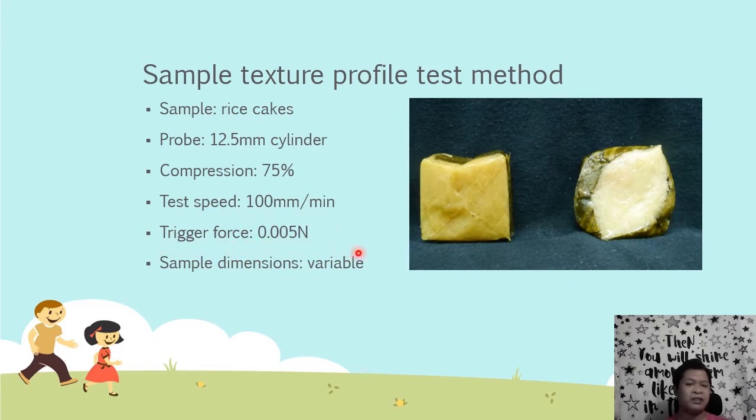Now, in this case, the samples themselves were tested as is. And of course, hindi naman sakto yun. Like, kahit keso mangun pa yung sample mo, hindi na siya kinakat. Kung ano yung size niya, yun na yun. No? In this case, the special condition para matest siya was that the samples were placed in a semi-rigid container, in this case, an origami box made from banana leaves, no?